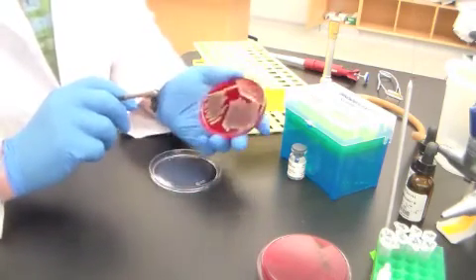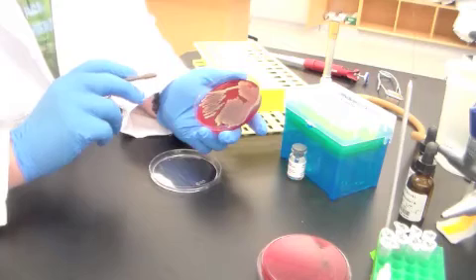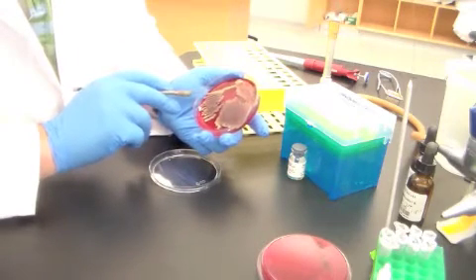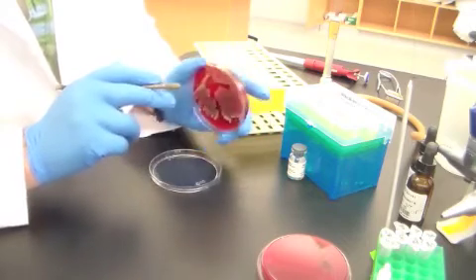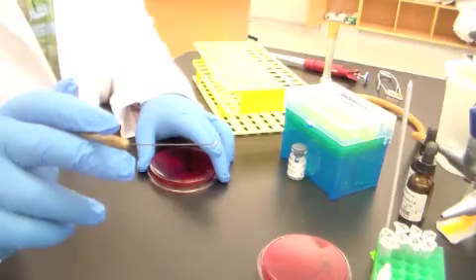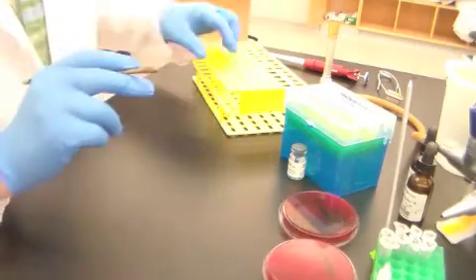But I'm going to take one of the staphylococcal species. You'll be provided with 3 different species, and I'm just going to take a pretty good slug of the bacteria just to pull through that. So you can see a pretty good chunk of the Staphylococcus on there.